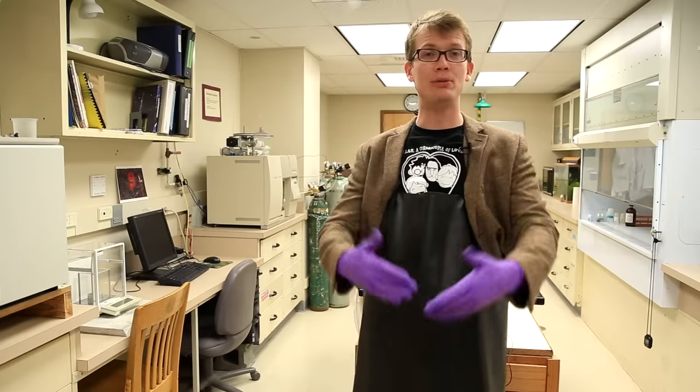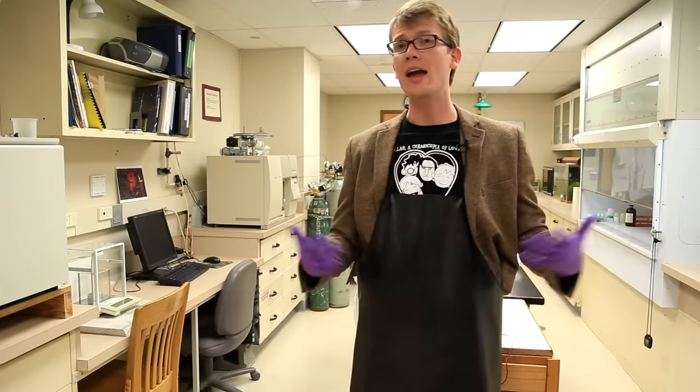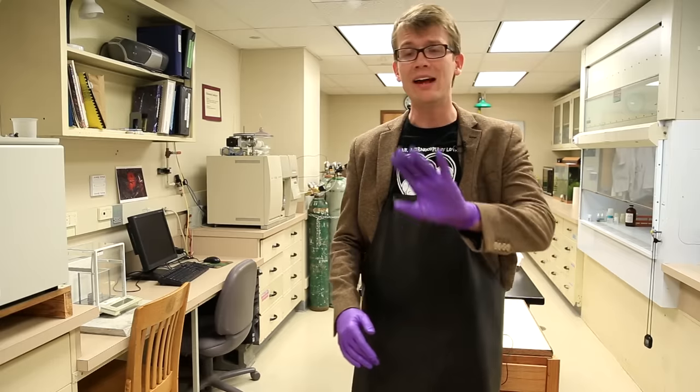This is an apron. It protects you and your clothes just a bit extra in case you're working with something hazardous, like concentrated acids. Aprons are nice, because they're easy to get off if you spill something on them. Well, if you're wearing pants, you might hesitate a bit too long before you ditch them. Which reminds me, if you spill more than just a bit of anything super bad on your pants, modesty goes out the window. Just take them off.